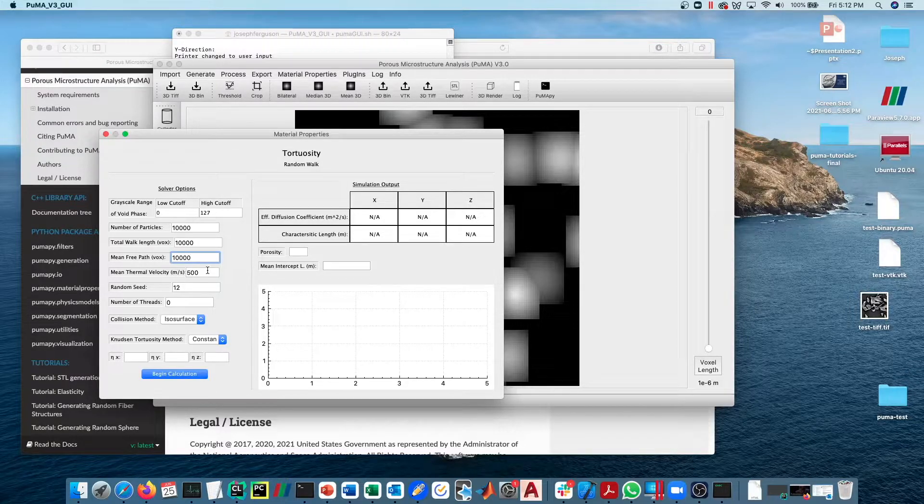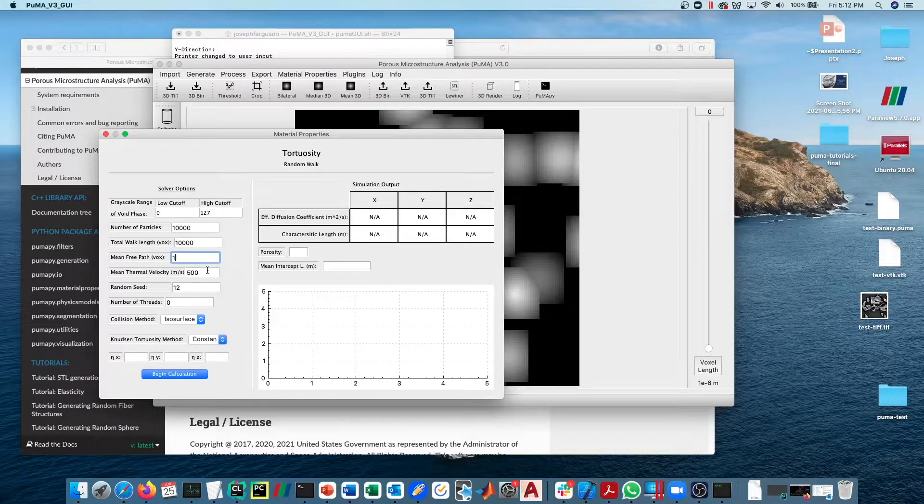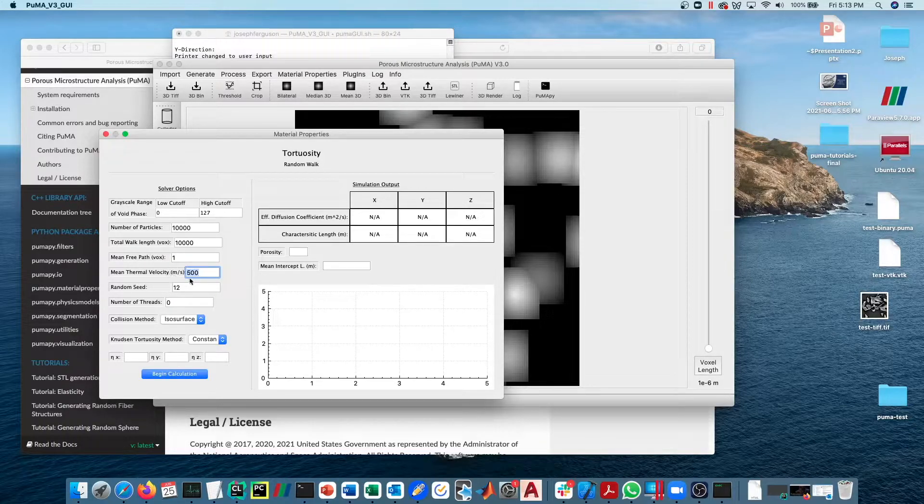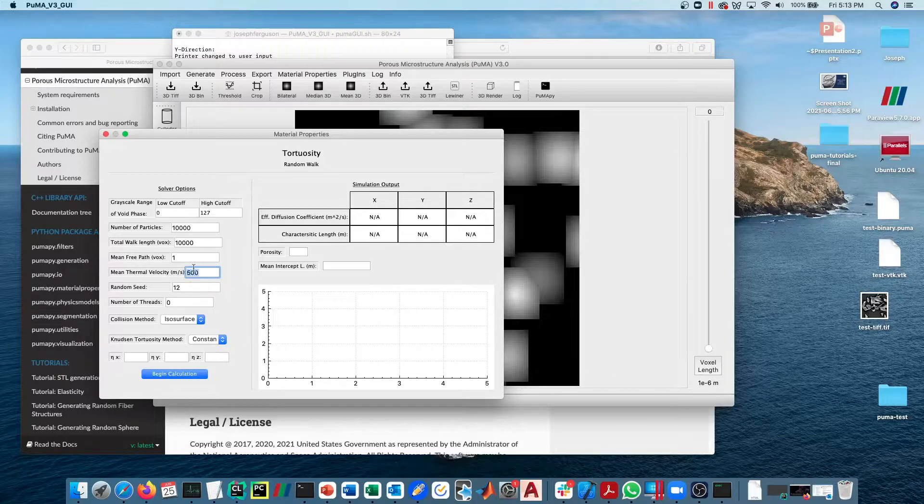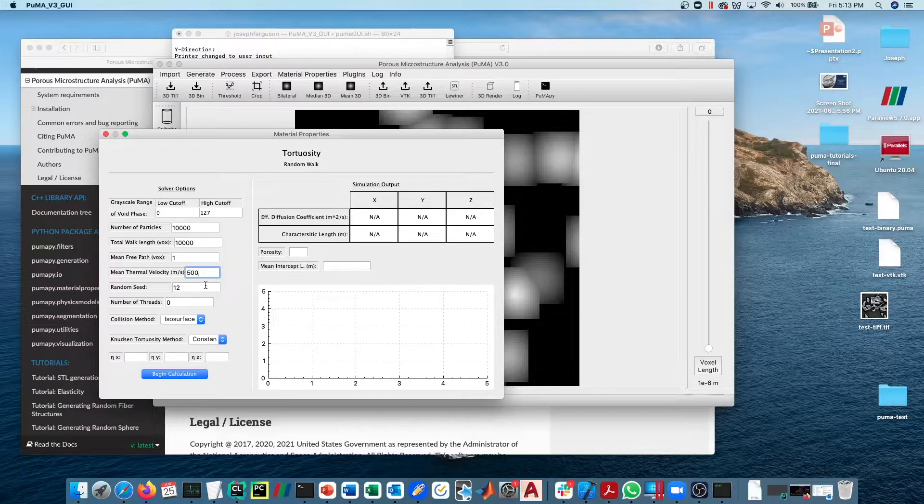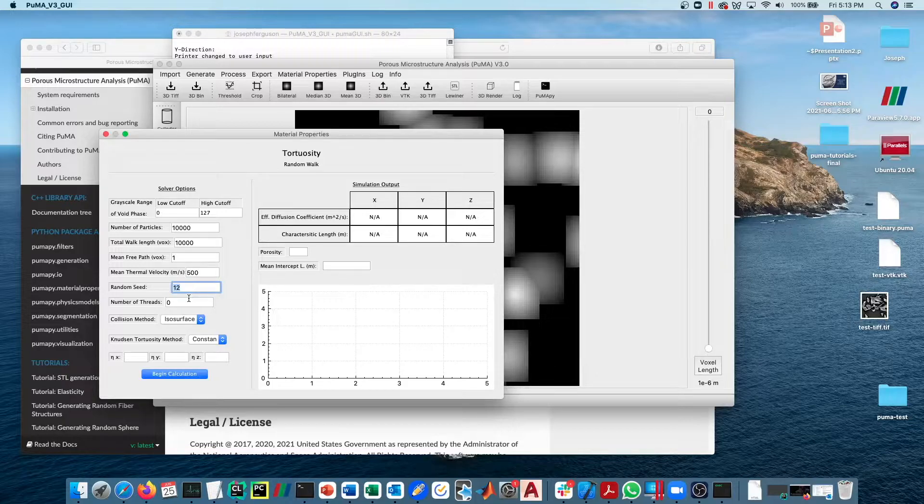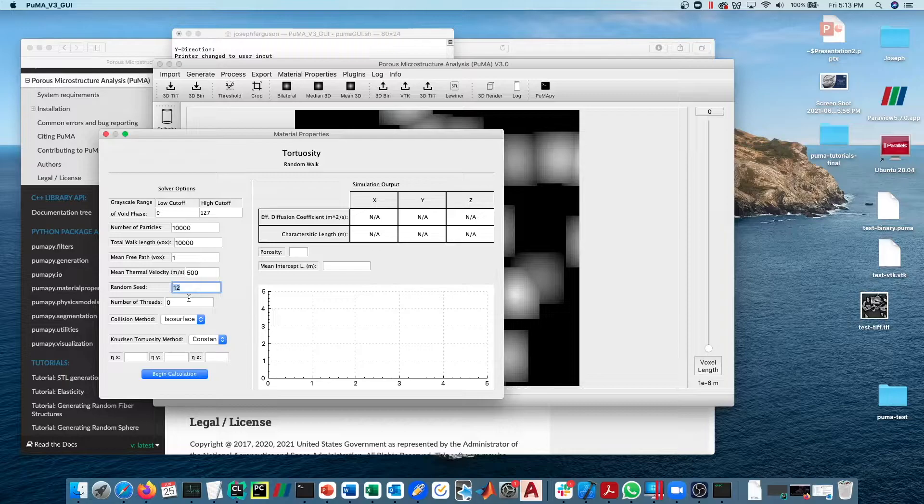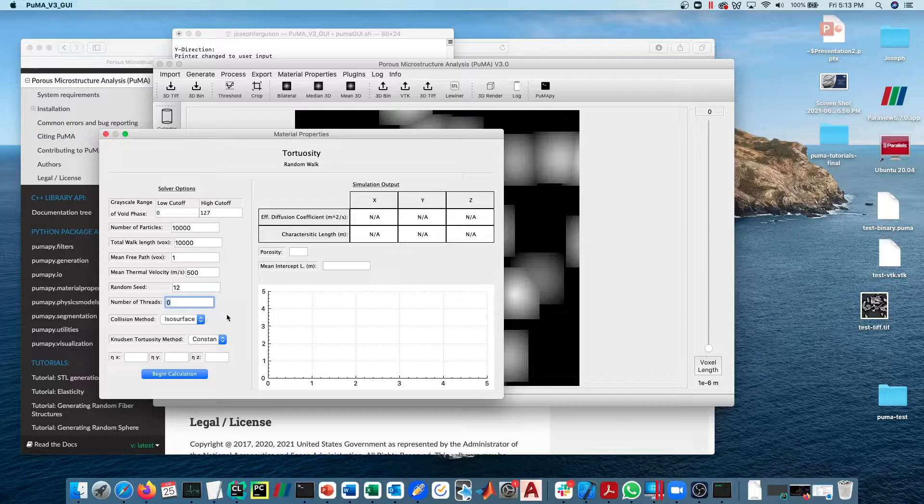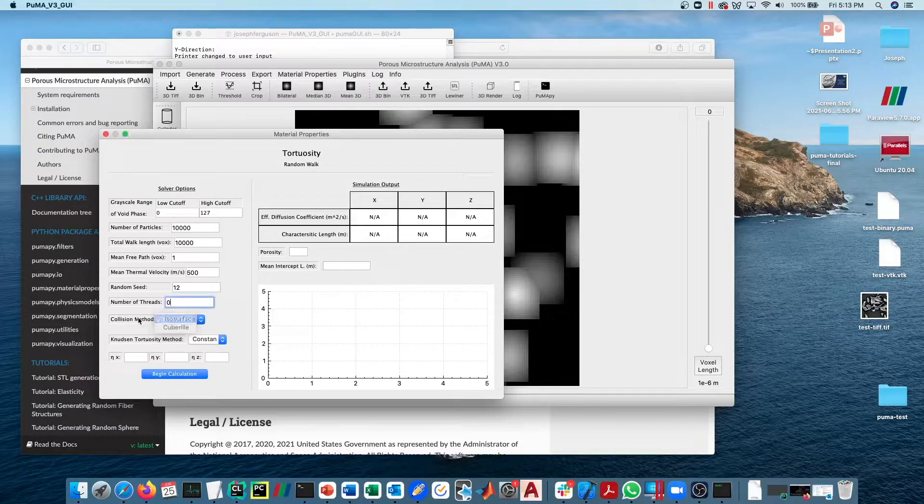Rarefied diffusion here is a little bit outside of the scope of what we're going to talk about. As I mentioned before, you can reference the upcoming paper or send me an email if you're interested in doing rarefied diffusion. For continuum diffusion, we're going to leave this value low. Mean thermal velocity is actually not terribly relevant for this calculation in the continuum, since this is going to average out in the end. It'll increase the velocity of the particles but then it'll be divided out in the end when we're calculating what the tortuosity is. Random seed can be anything you want, though you typically want to use a repeated random seed if you're trying to debug a simulation or something. Number of threads, once again, zero defaults to the maximum, so we'll just leave it at that.